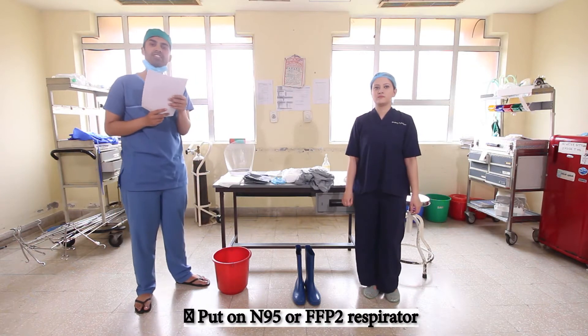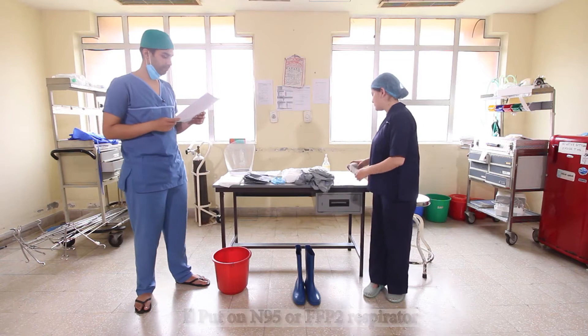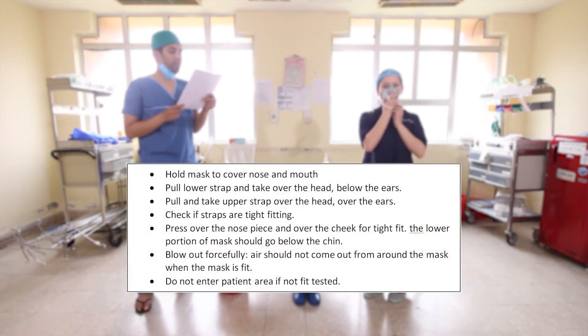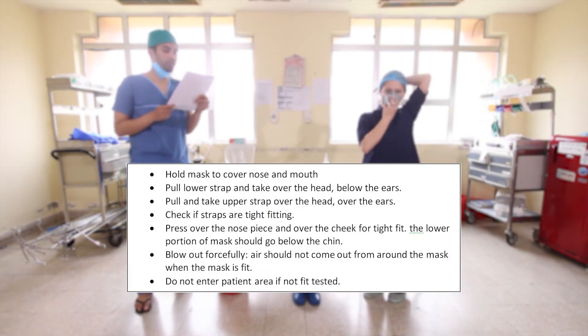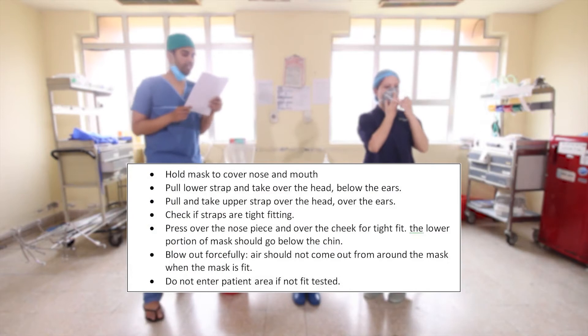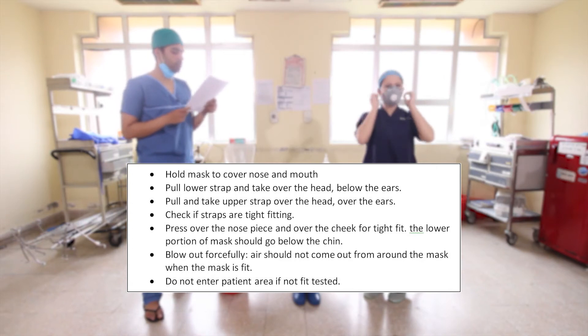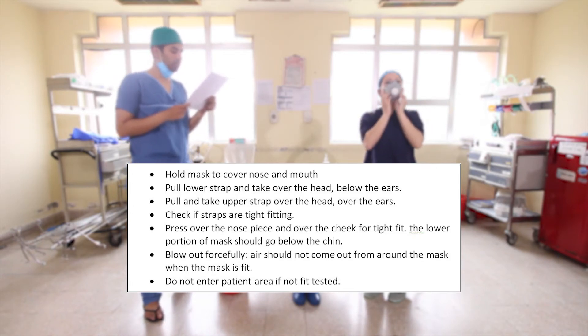Now we shall move on to put on the N95 or FFP2 respirator. Hold the mask to cover the nose and mouth, pull the lower strap and take it over the head below the ears, then pull the upper strap over the head above the ears. Check if the straps are tight-fitting, and press over the nose and cheek for a tight fit.